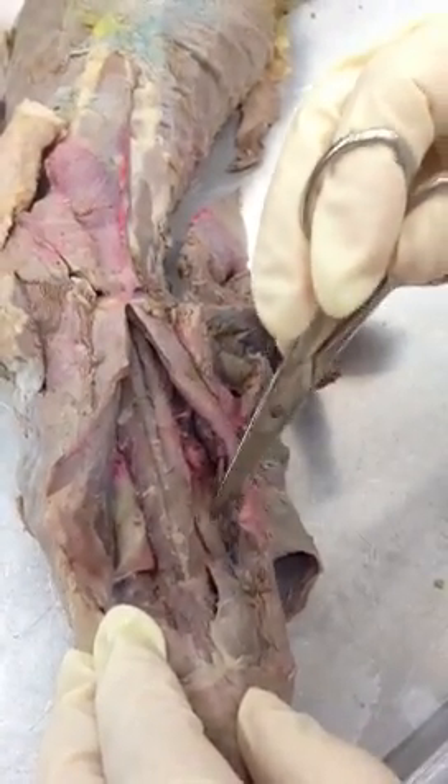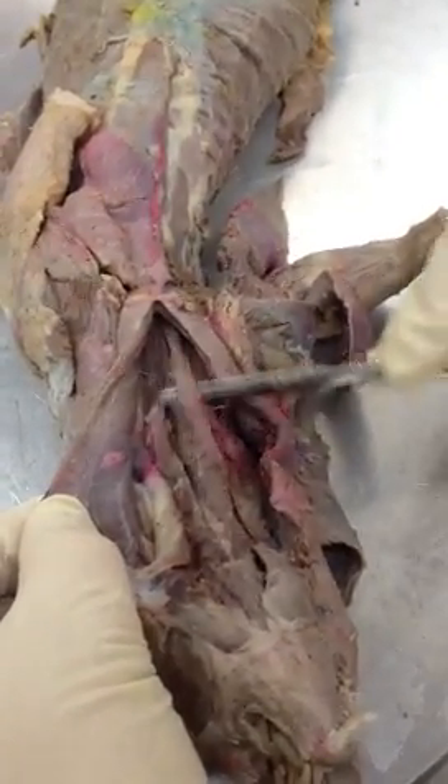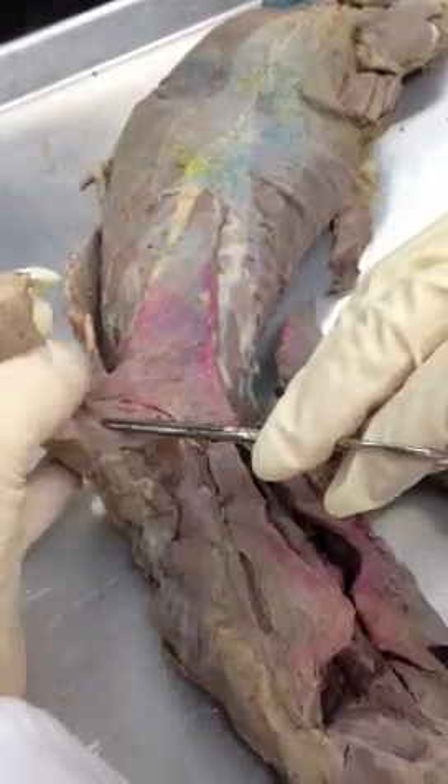Thyroid gland — mine's kind of right in here, so I'm going to bury it. Those are the two thyroid glands right there. But you can still see the sternohyoid muscles. Down here, we can see three muscles — first, clavodeltoid.